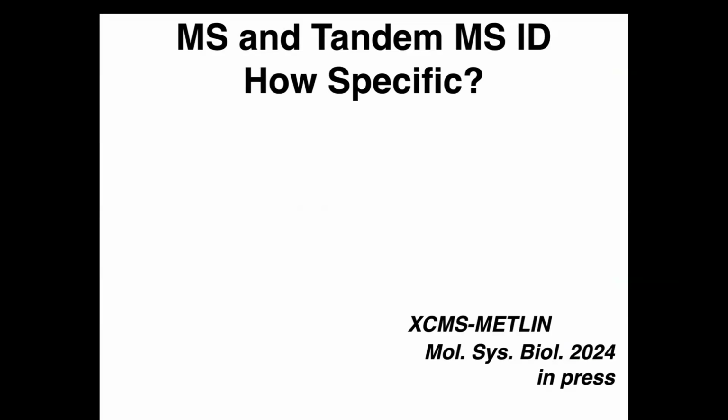I just showed you specific molecules where we have MSMS data for each molecule, and the similarity is quite nice, so that's great. But if we're dealing with what we consider fairly astronomical numbers, 936,000 molecules is a really large number of molecules to be analyzing MSMS data against. Are we going to have problems with respect to how many molecules we typically identify when we do this?